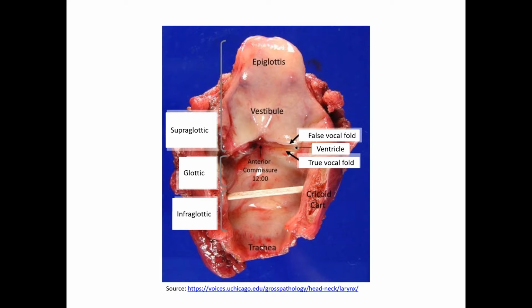It depends on where the tumor is located. Generally speaking, any section that would give me the depth of the tumor perpendicular to the mucosal surface. That's probably the most critical section, because the overwhelming majority of these are squamous cell carcinomas arising from the surface epithelium.